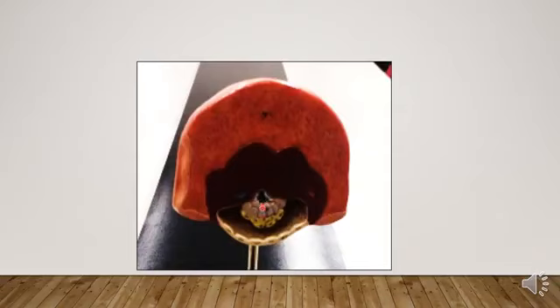is formed by epiblast. Clear? We have epiblast, columnar in shape, and hypoblast, cuboidal in shape. When we point to the cavity, it is called the amniotic cavity, but the cells in the roof we call amnioblasts, cells of the amniotic cavity. And hypoblast, you can see, is near the blastocele.